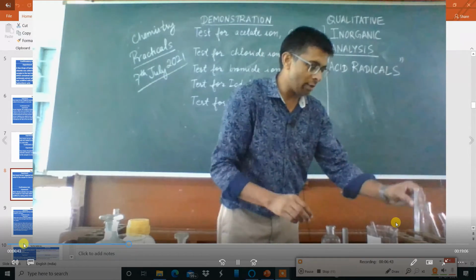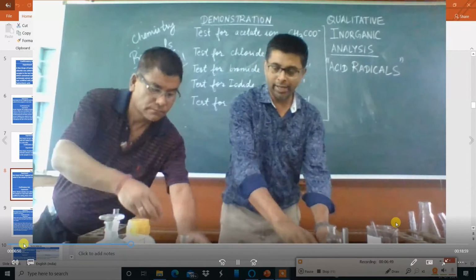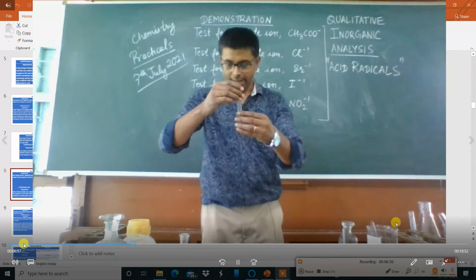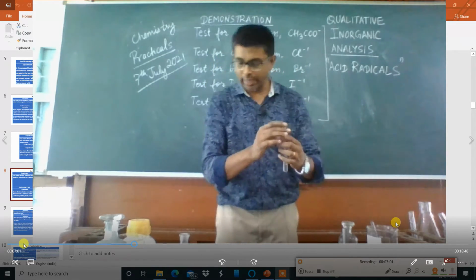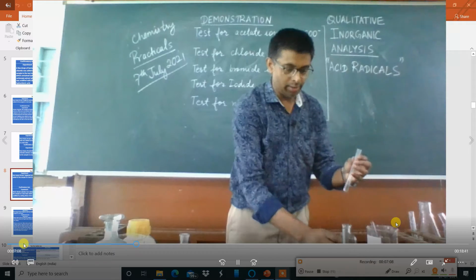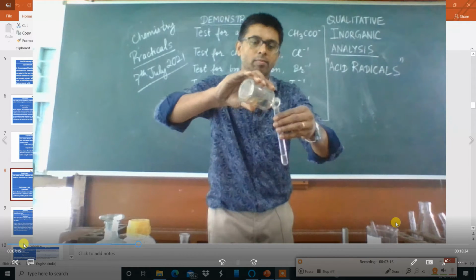After this, I went ahead to show you the confirmatory test for the chloride ion, where to the solution of the chloride sample I am adding silver nitrate solution.